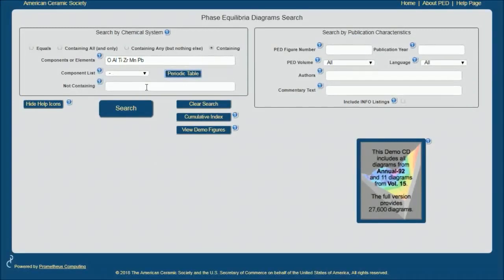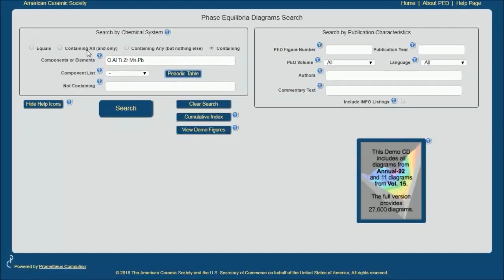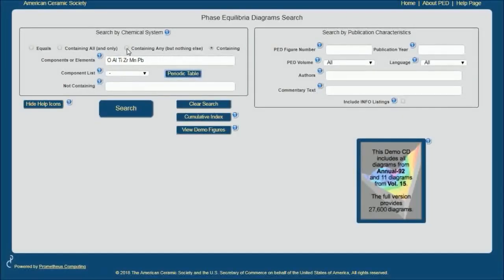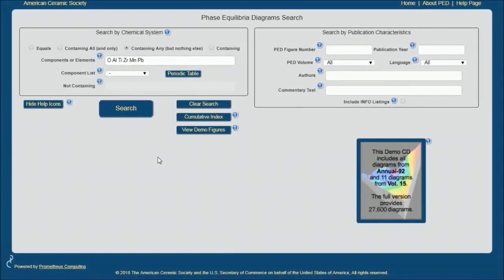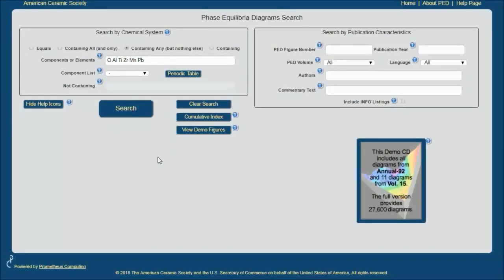I can choose not containing to limit just a few elements. I can do very highly limited functions, but I'm going to choose one that's in the middle: containing any but nothing else, which means it will call up phase diagrams that contain any of these six elements but no other elements.